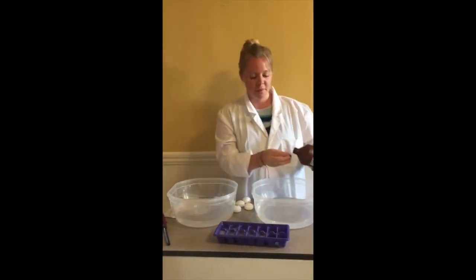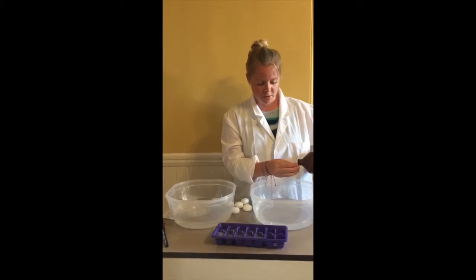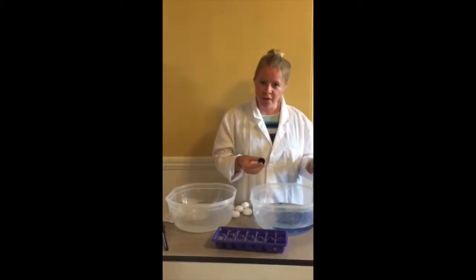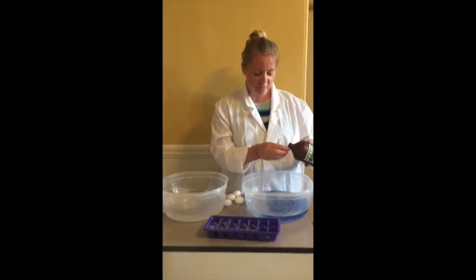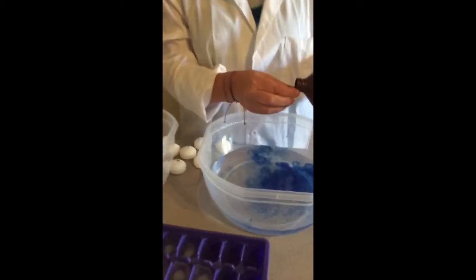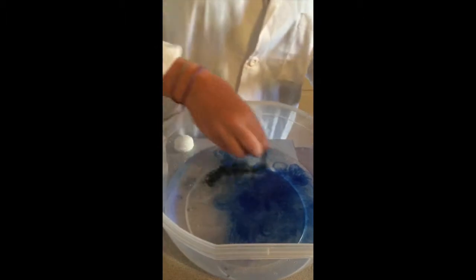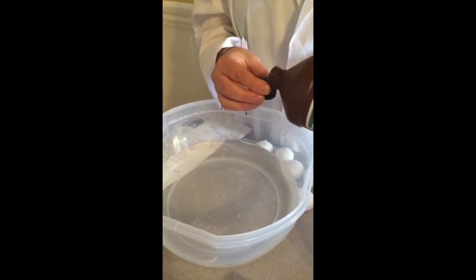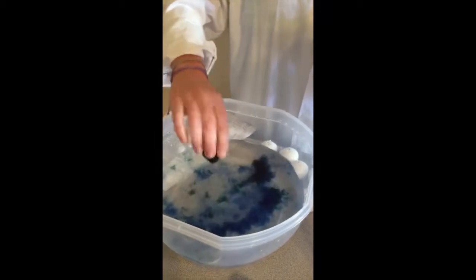So I'm going to put a couple capfuls into each. And now you notice it's turning blue. That's because this indicator is slightly basic, and the water has a pH of 7, or a neutral pH. So if you remember, with experiments, it's really important to do exactly what you do to one to the other, with only changing one variable.